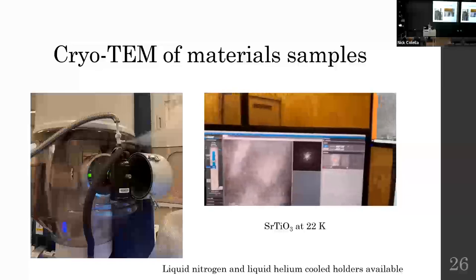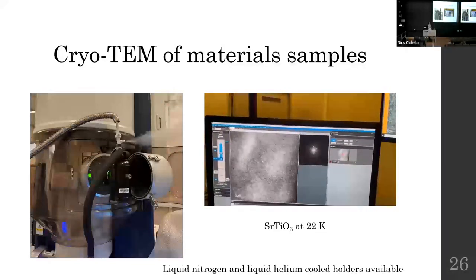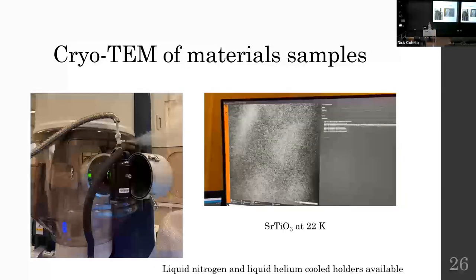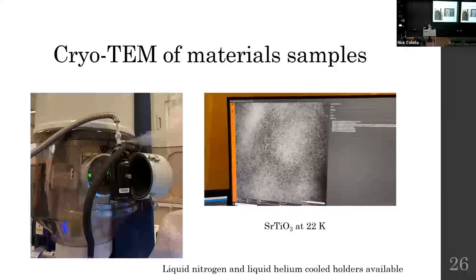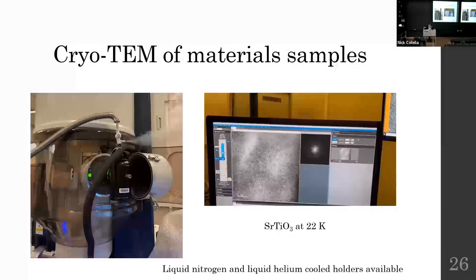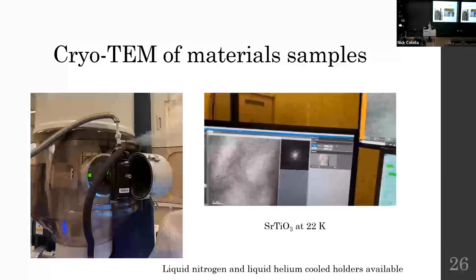So when you cool something down or when you heat it up, it's going to expand or contract. If you're cooling something, you can get vibrations from the coolant, be it helium or nitrogen, bubbling off. And so that kind of wrecks your images.